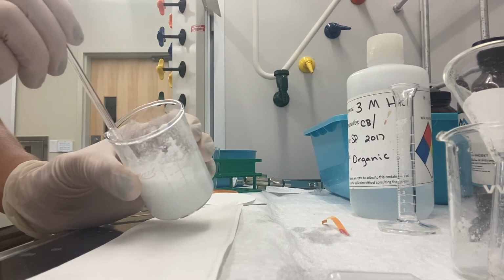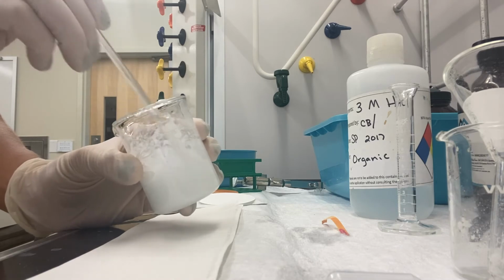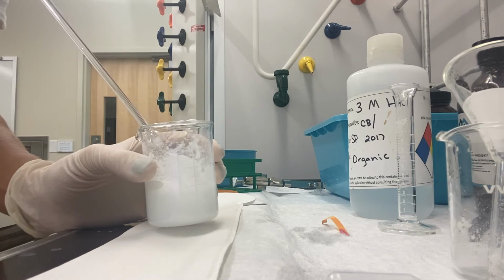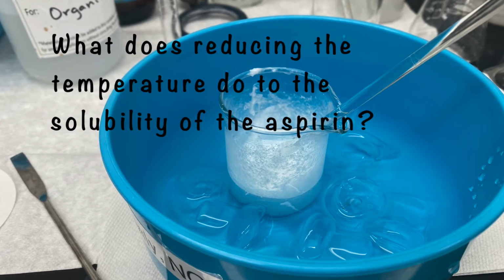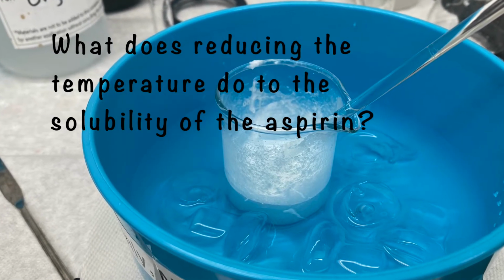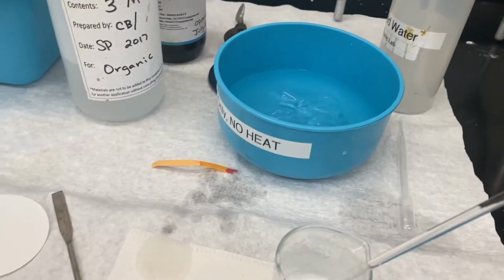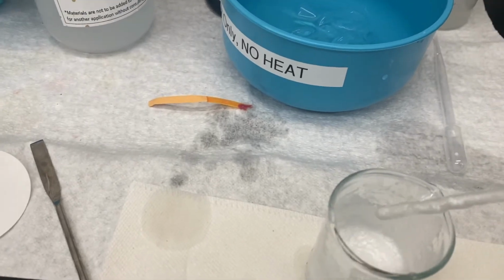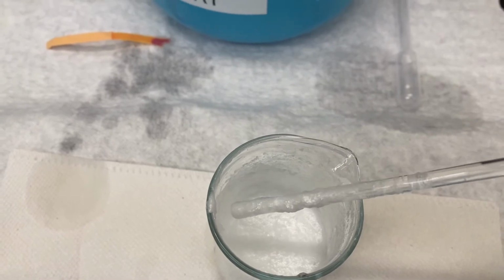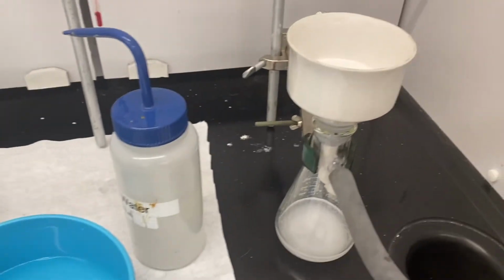And we're going to cool this solution just to make sure we maximize all the solid coming out of that solution, precipitating out, and then we'll filter this off using vacuum filtration. So this has been cooling for a little bit. I just took it out, and you see we've got lots of white solid in there, almost crystalline-like. So we're going to go ahead and separate this using our vacuum filtration.